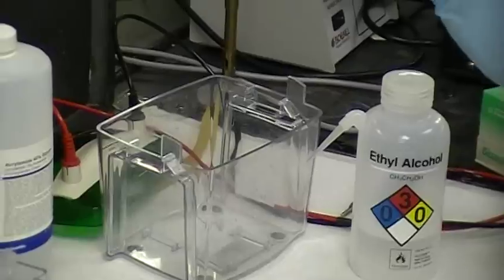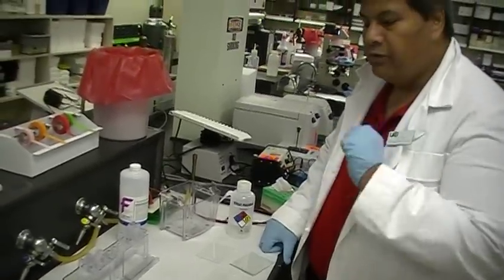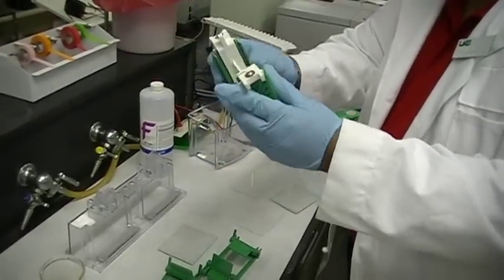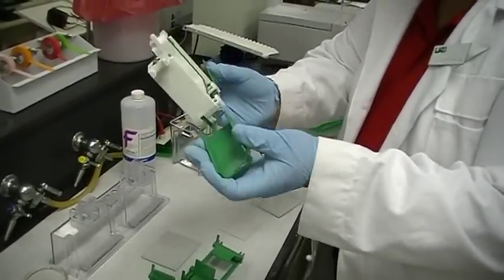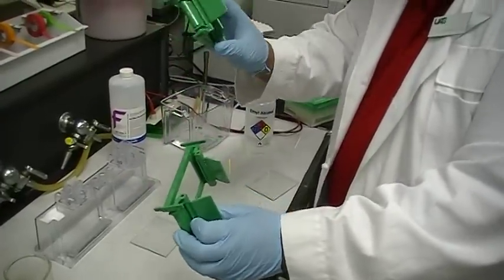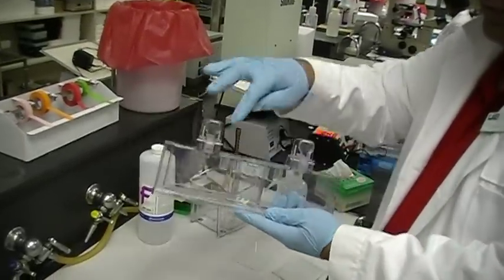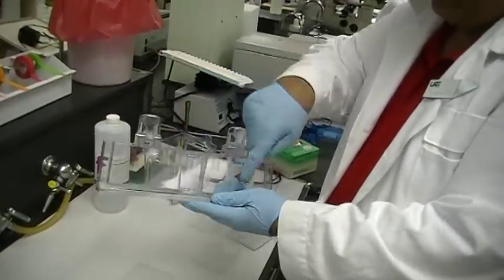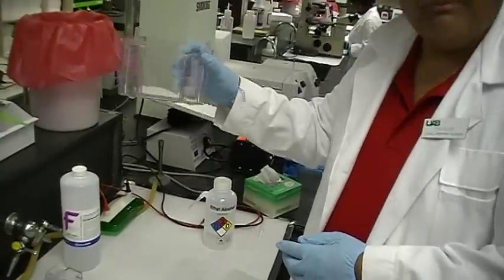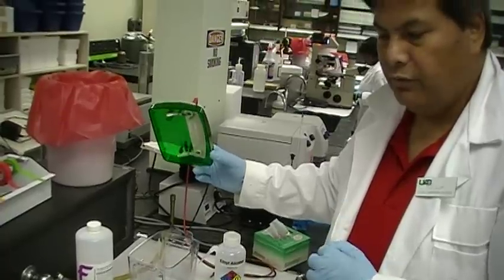Before you begin, if your instructor tells you that you're going to pour two gels, here's what you need. You need one of these cores — this is a core, that is a clamp — that's going to help you with two gels. You need two of these clamps; each one will clamp one of the gels for you. You need a stand, and usually some stands would either have four gels or in this case two to pour two gels. And then you need a gel box and a lid for that gel box. This is everything you need to run two acrylamide gels.